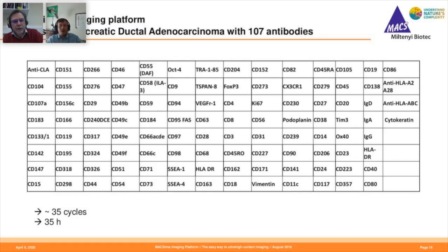But yeah, like you say, a lot of it's spent on the staining of the samples and then the preparation for the next cycle, right? And erasing and all that sort of stuff. Yeah. Okay. If you have a quick look at the chat window, which is now enormous, you think you could pick up quickly and answer one or two questions? Yeah.